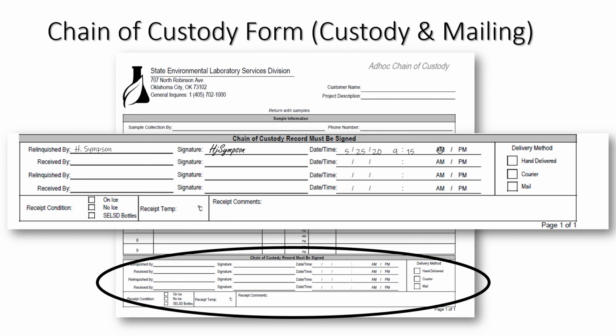If your samples are required to be stored or shipped on ice, pack them in a cooler or container and fill with ice. Pack samples in a way to protect them from breakage. Glass containers should be wrapped in bubble wrap or plastic. If you have any questions about how to store or ship your samples or the cost of your requested tests, please call the laboratory.